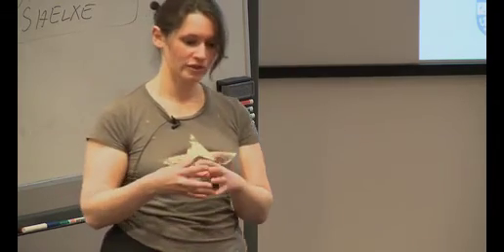Why can you do SAD from twinned crystals? Why does SAD succeed with twinned crystals? It depends on the type of twinning. What you're really doing when you have a merohedral twin is you have limited your signal further. So the signal will be smaller, but it will still be there.